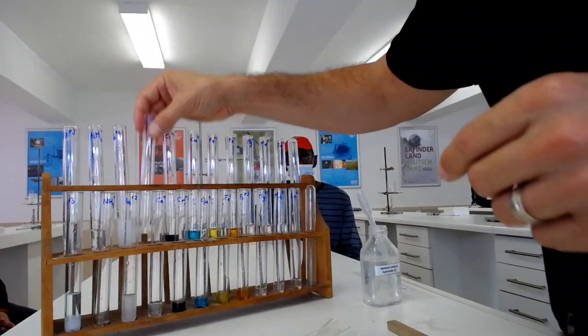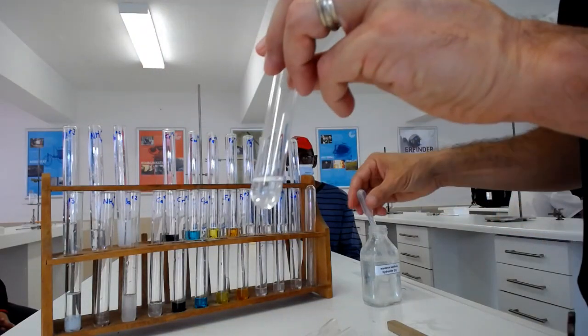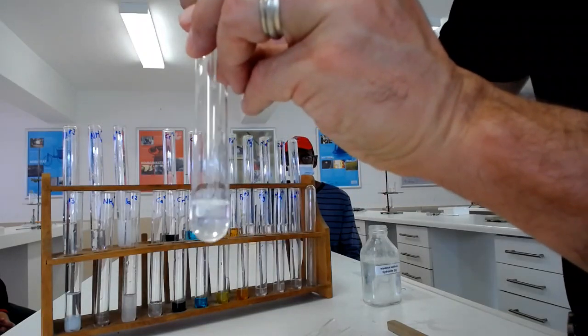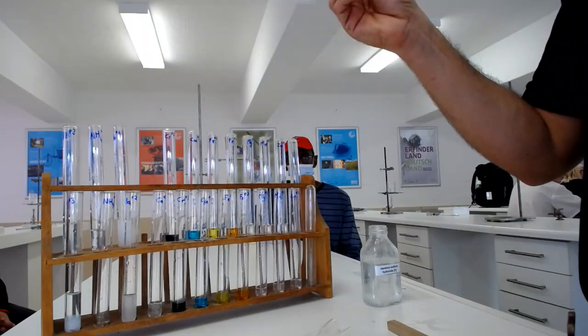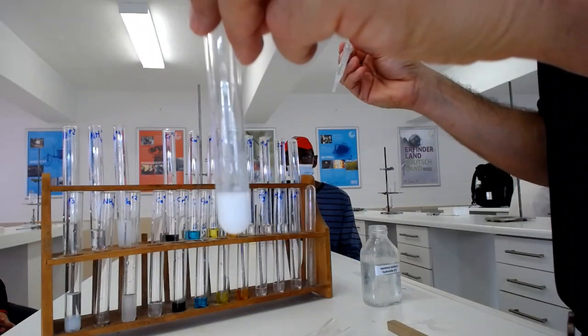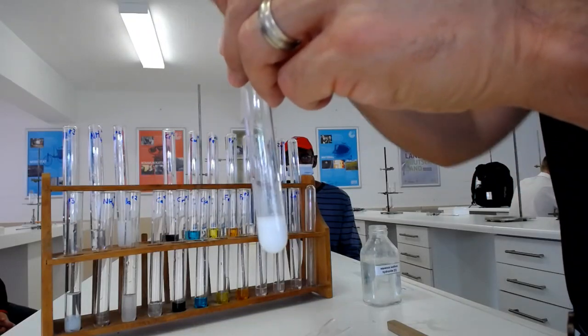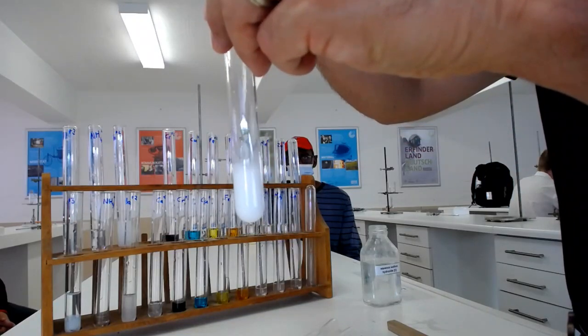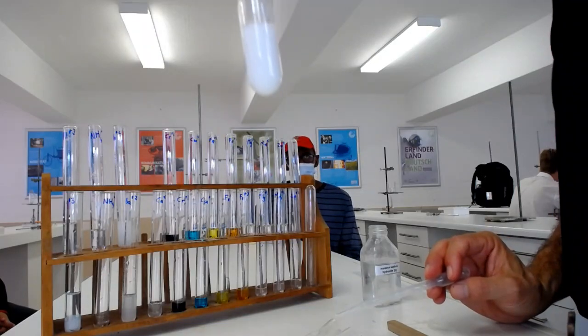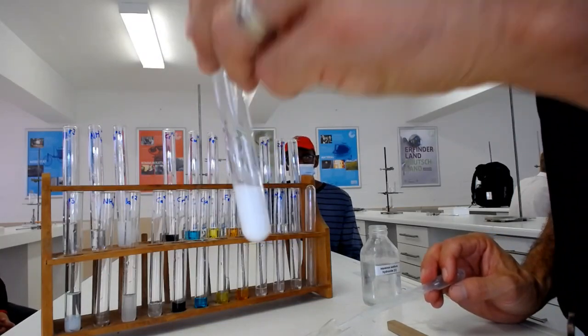What about calcium? What does calcium say with sodium hydroxide? White precipitate. Oh, this is a nice white precipitate. Look at it. It's very nice and white. Right, so what happens if I add excess? Nothing, it just becomes more, and it's still a white precipitate, so it stays insoluble.